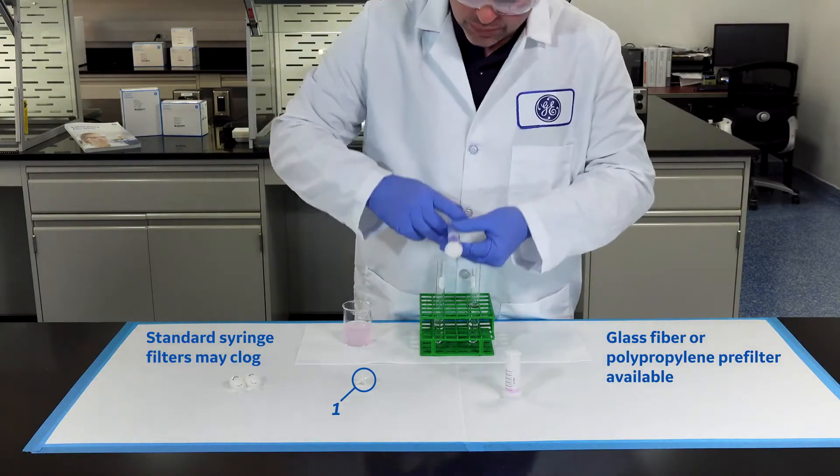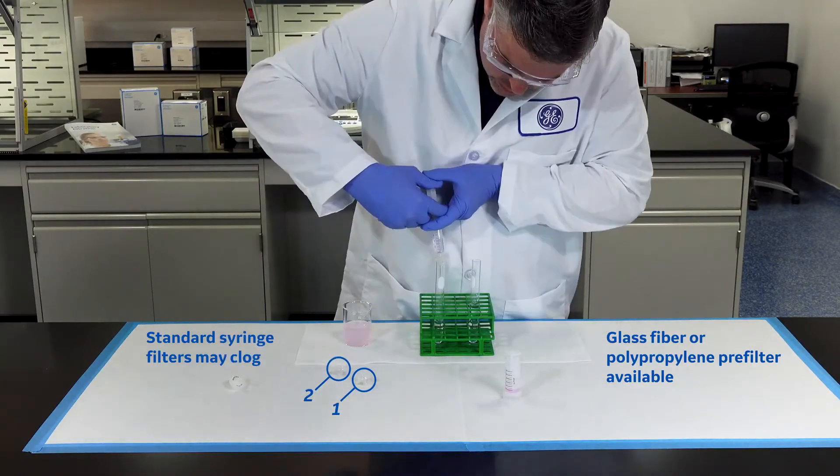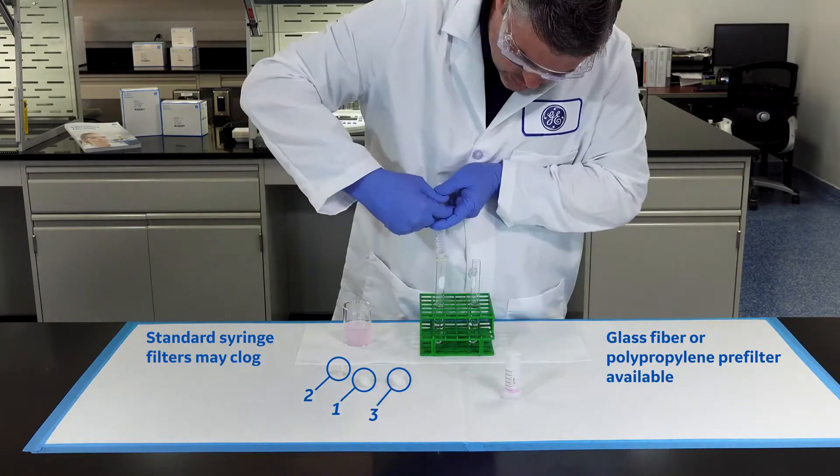The sample shown here would have required at least four syringe filters using the conventional method due to clogging.